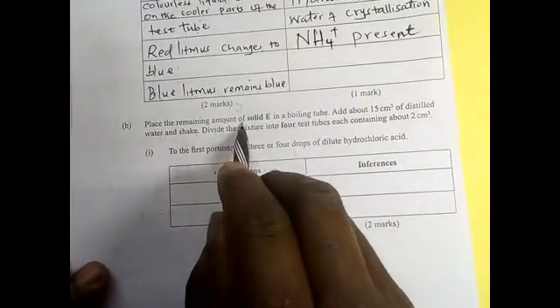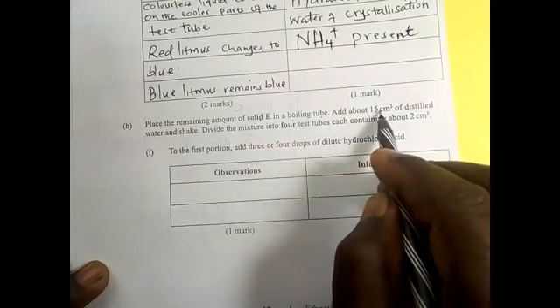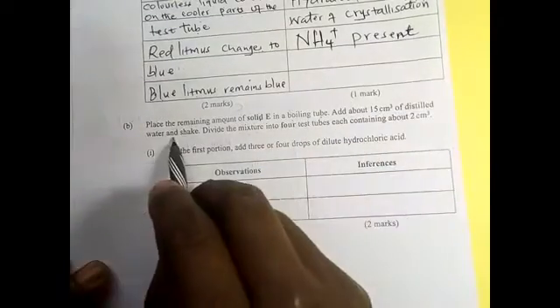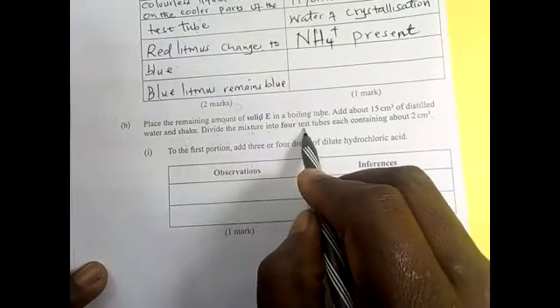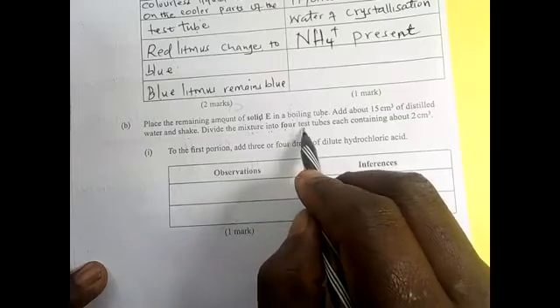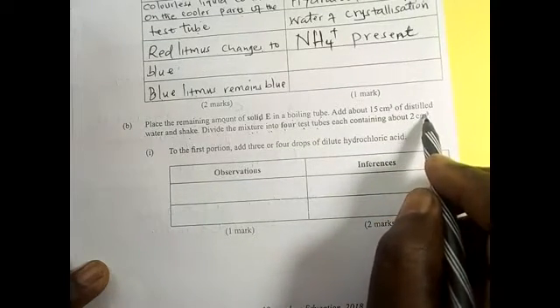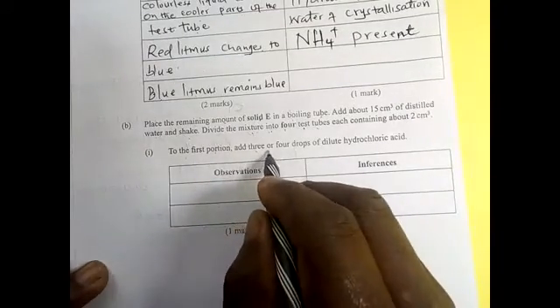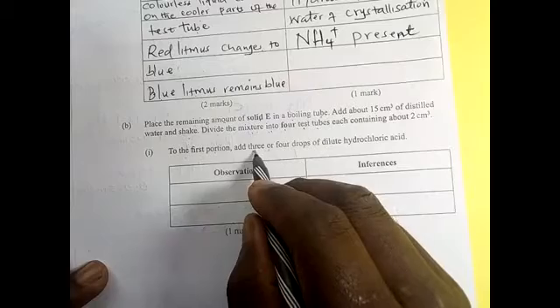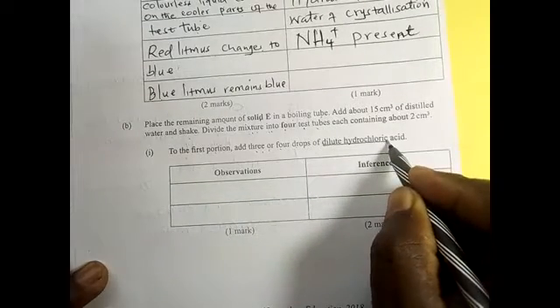Place the remaining amount of solid E in a boiling test tube. Add about 15 centimeters cube of distilled water and shake. Divide the mixture into 4 test tubes, each containing about 2 centimeters cube of the solution. Now to the first portion, add 3 or 4 drops of dilute hydrochloric acid.